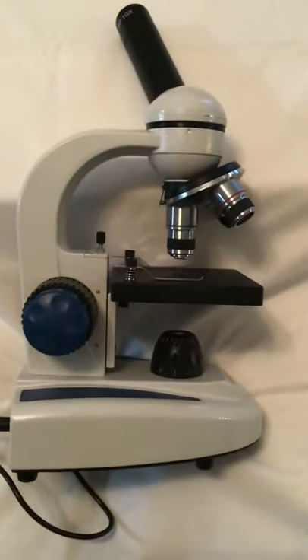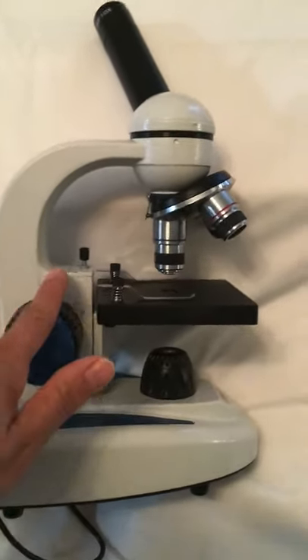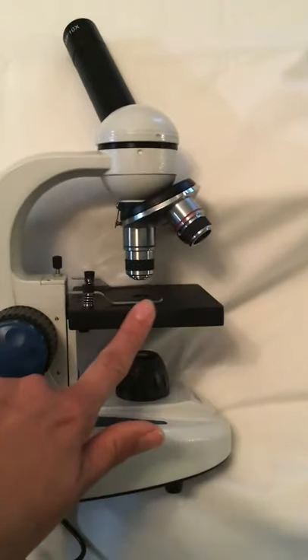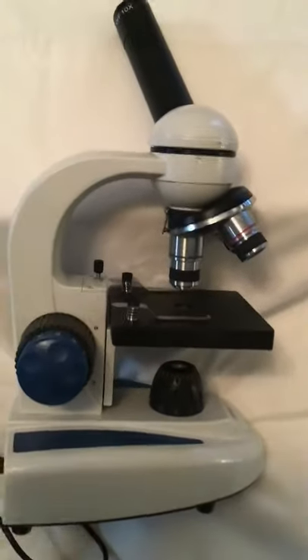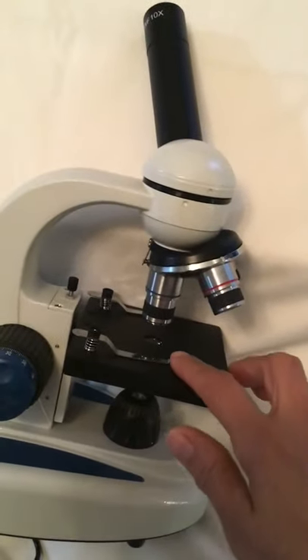Then we go down to this little black table. This little black table is called the stage, and the stage is just a little table with a little hole in the center. It's got a little lens in there, and the slide is placed on here and is clipped right under these stage clips.